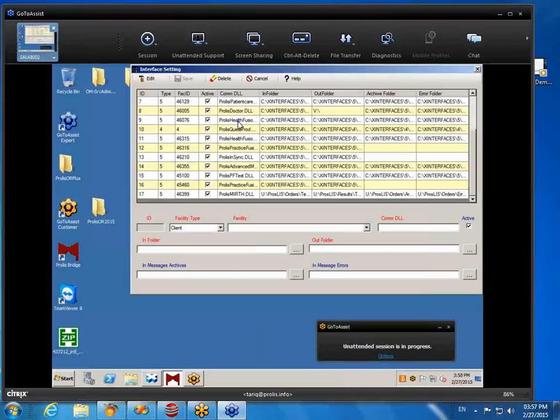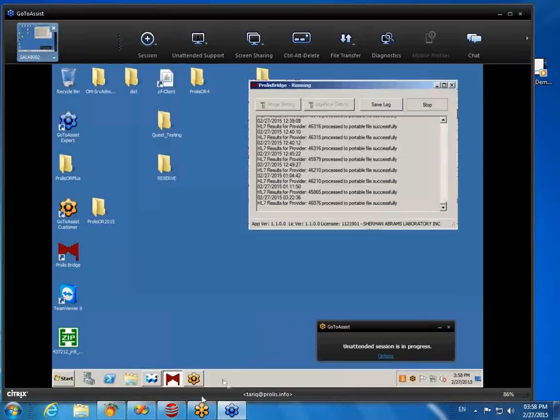Apart from the technology, I'm asking a process and a business question. The ultimate goal that we would like to have is the LIS directly integrated to the doctor's EMR, so we can pull in the information from the EMR, like patient name and demographics, directly into the LIS system. That's what I am saying. If it's a bidirectional EMR and the doctor enters any order, it comes to Prolis like this. Let me turn this on and go back to Prolis, and I'll show you where the information comes in.